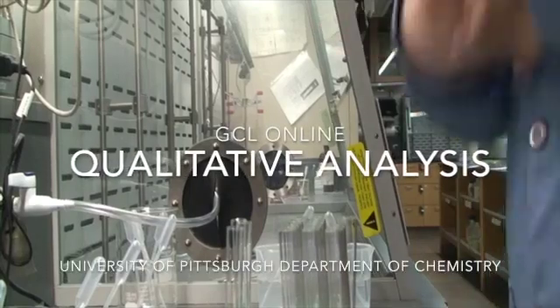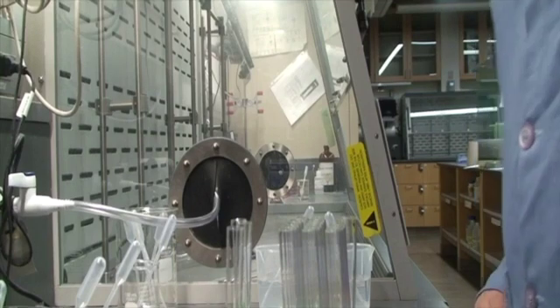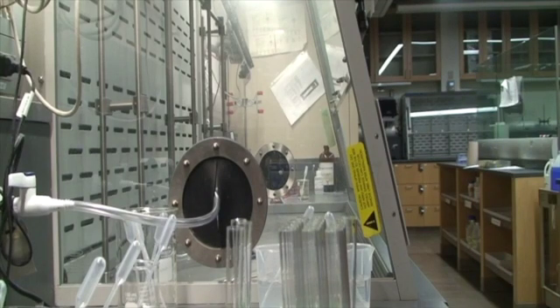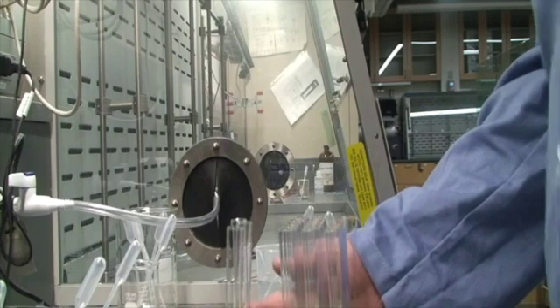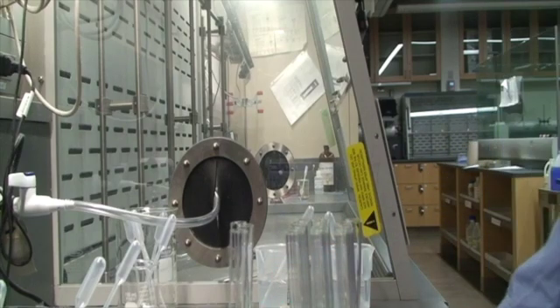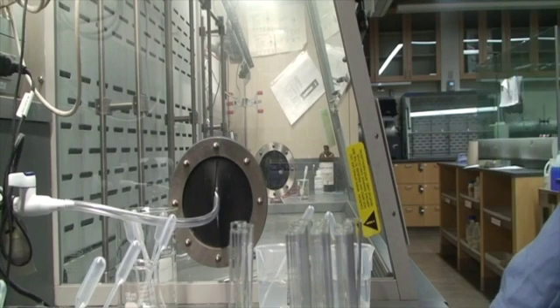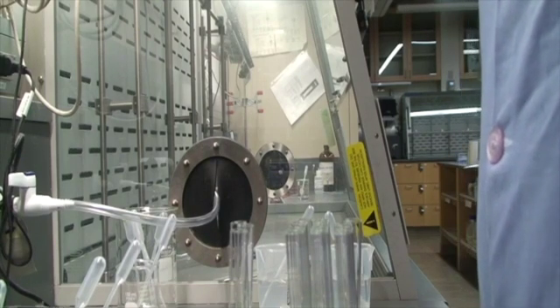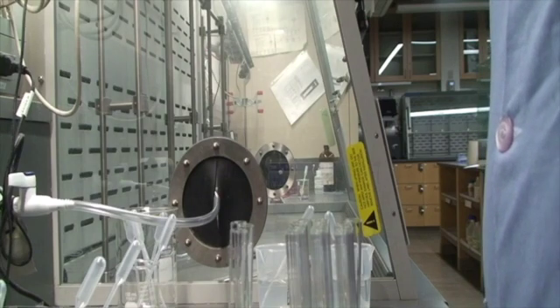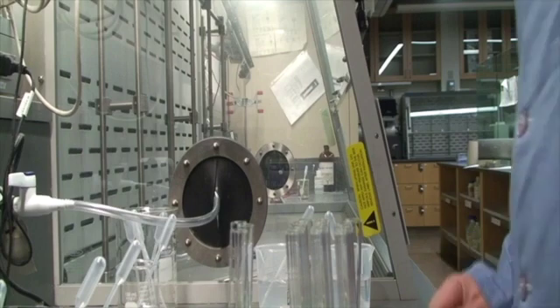Okay, so we're going to do qualitative analysis. This is experiment 12 for Chem 110. In the first part of this experiment, we need to identify 6 unknowns. I grabbed the green set of solutions. That's the set of solutions we're working with, the green set. So we have unknowns 8 through 13.